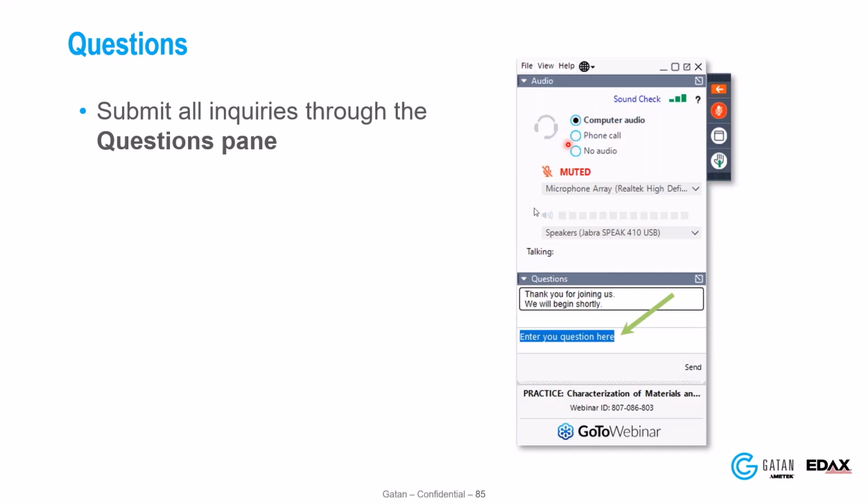There's a question here: is the orientation refinement available in OIM, or only for OIM Matrix? It is just part of OIM Matrix. It's part of an optional module that includes the spherical indexing. The file format handles the Kikuchi patterns and orientation maps. So this works with our individual OSC files, or also our EDAX H5 files, and we save the patterns we use with the UP1 or UP2 file format that comes out of APEX or TEAM. If you have the old pattern files as individual patterns, you can load those into OIM Analysis and then export it out as a pattern file to make it work.